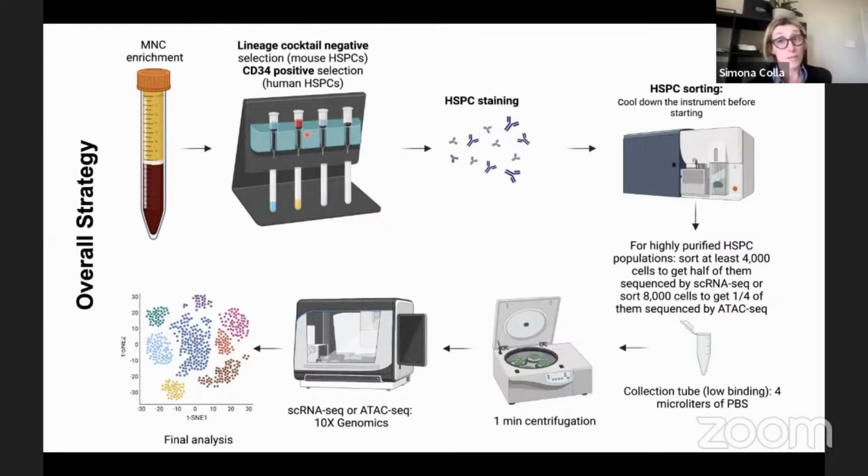So you need to have an enrichment. The first enrichment, particularly if you do stem cell analysis, is based on the lineage negative depletion or the CD34 positive enrichment.